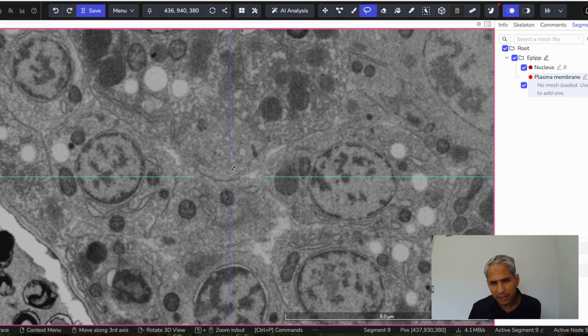Okay, let's go a little bit deeper. I'm still 95% confident this is plasma membrane. Look how dark it is compared to its other sides. And then there's a gap here between my cells and a gap here. So I think my cell is going up like this and like this. And then there's some squiggliness here I won't stress about, but I can sort of say plasma membrane here. The texture here is very different than the texture here. And the previous slices were still confined to this region.